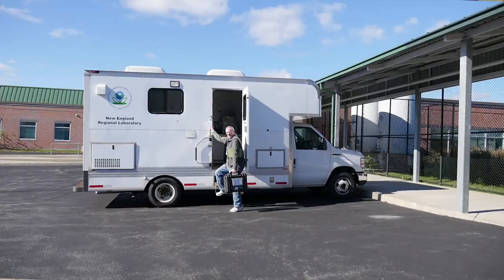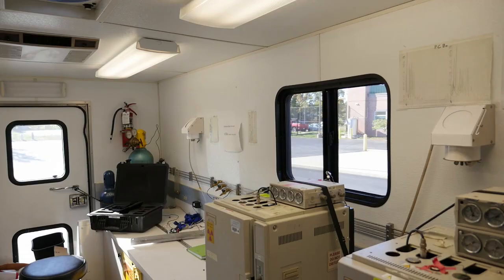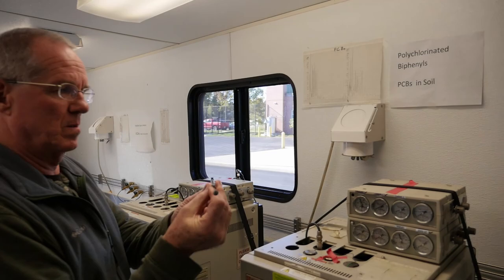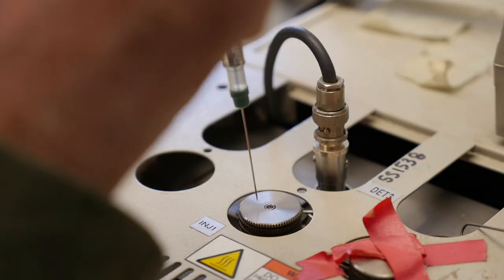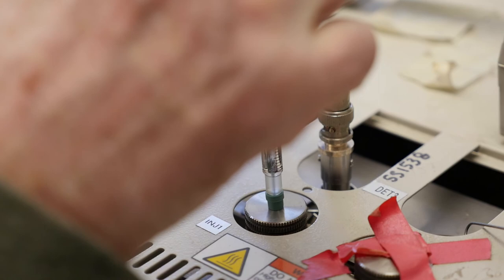You can get these volatile compounds evaporating out of groundwater and entering into homes. At the Walton-Lonsbury site, we did sub-slab vapor intrusion type samples where I could go in, take a grab syringe sample and inject it into my GC and we can get results immediately.